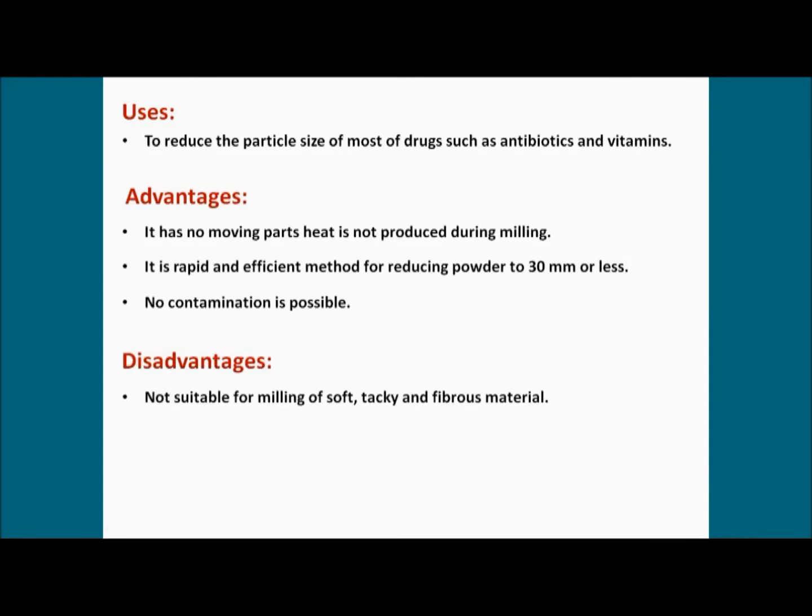But there are disadvantages. This mill is not suitable for milling of soft material, tacky or fibrous material. Moreover, the equipment is very expensive.